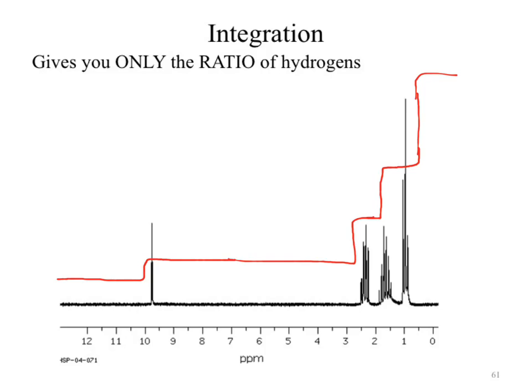It's the integration curve. Okay? So the really old-fashioned way to do it was to cut out this section and then stack it over here to count how many times it repeated, how many times it repeated, how many times it repeated, and then you would say that first section was defined as 1H, and you figure out your other things.